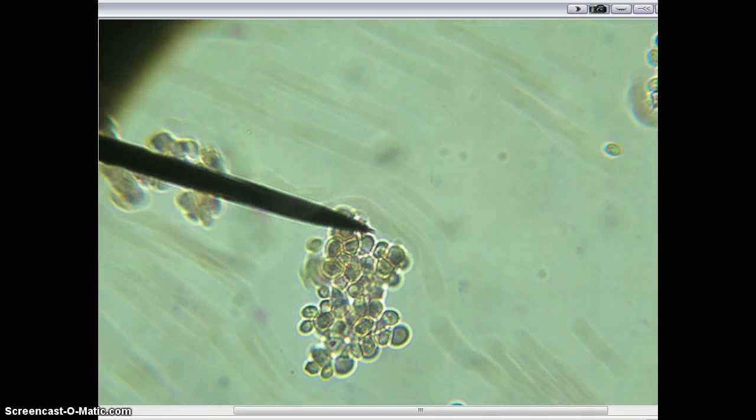This is due because these were dead yeast cells. The one on the other slide was living yeast cells, and like I said, I put a red dye in the water with them.